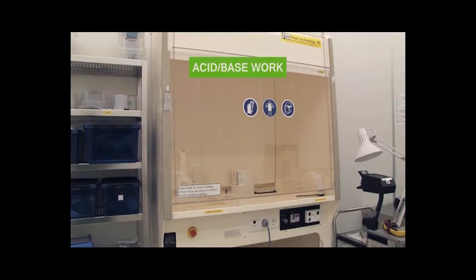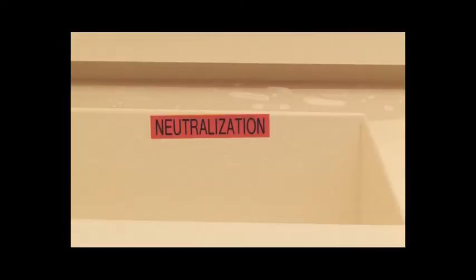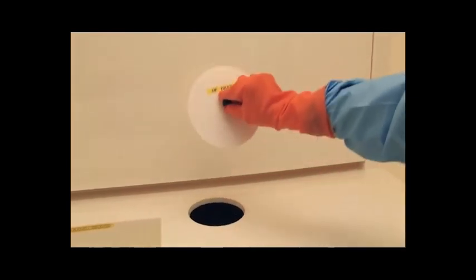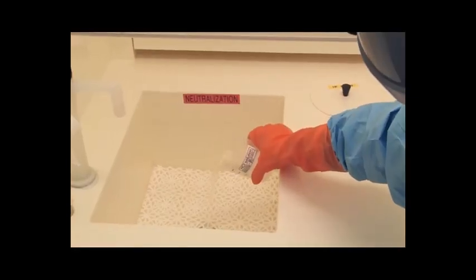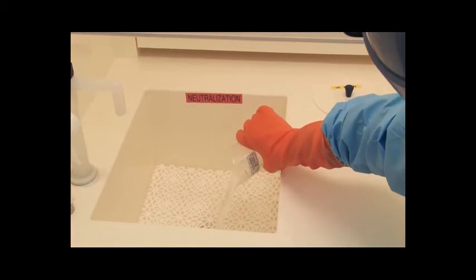The fume hoods and wet benches designed for acid base use are equipped with neutralisation drains and some fume hoods have an HF drain as well. You can pour acid base solutions that do not contain hydrofluoric acid or other fluoride compounds into the neutralisation drain.